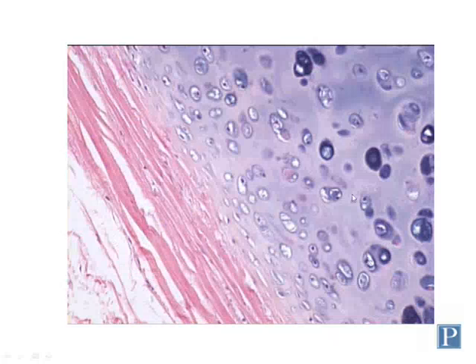Here's a higher magnification view of the cartilage. It's been stained with H&E, and you can see hyaline cartilage matrix is fairly basophilic. Some areas are more basophilic than others, and there are two distinct regions in the matrix we'll talk about in a minute that have different chemistries that make them react differently to the H&E stain. First I want to talk about a section of the hyaline cartilage.